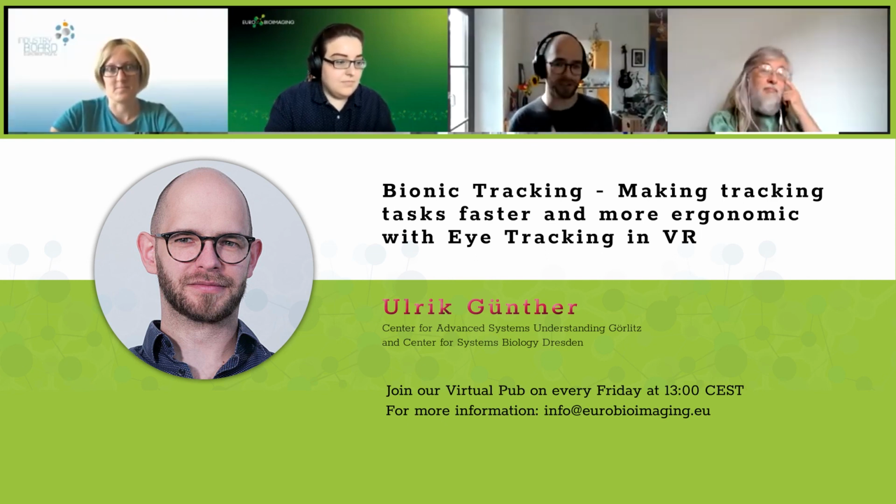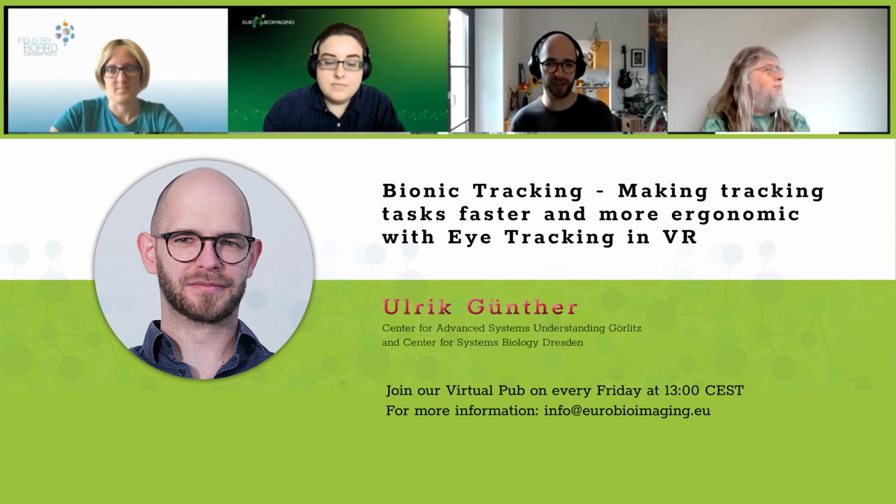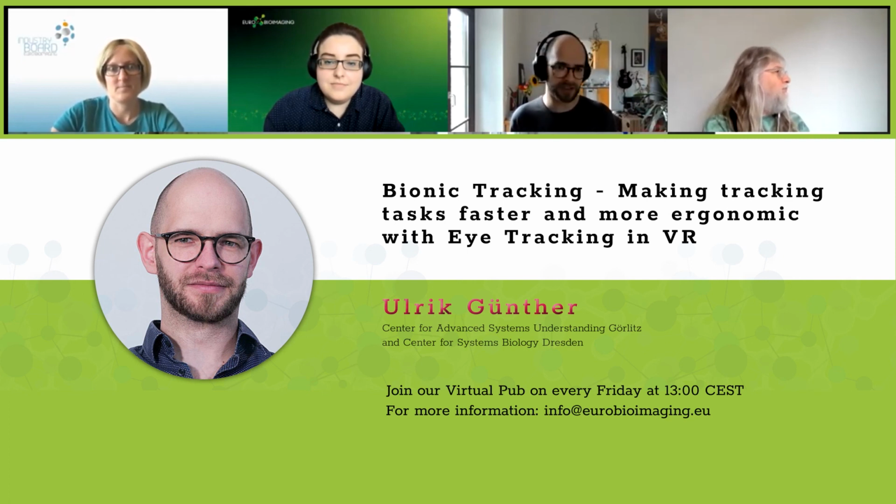And that's actually also an interesting point, because if you think about automated approaches, you could ask where the things are that we want to improve. You could introduce some uncertainty metric on your automatic algorithm, and then with the bionic tracking approach, improve just those areas where the algorithm says it is unsure. So reproducibility, as said, is an issue in general in tracking. And with reliability, we didn't have any issues. Some of the participants in our study were actually myopic, and they didn't report any issues with that. So I hope this answered your question.